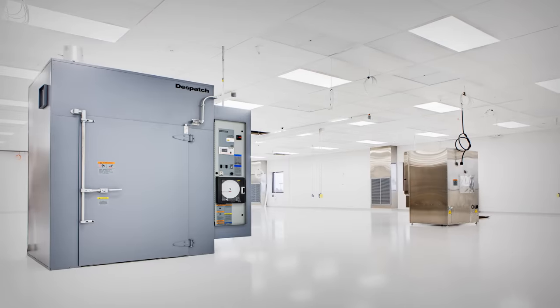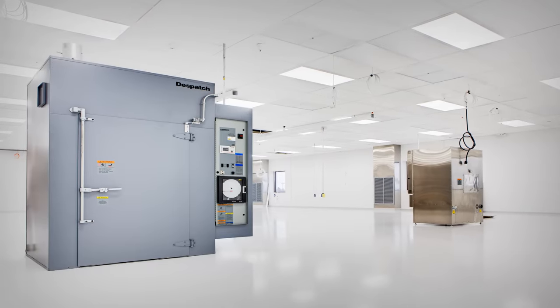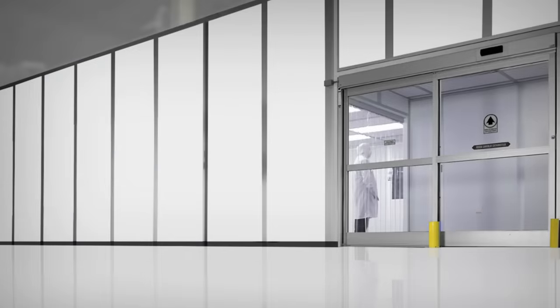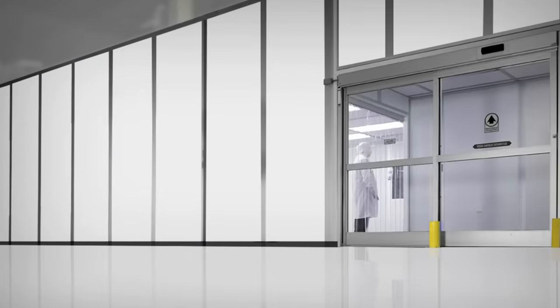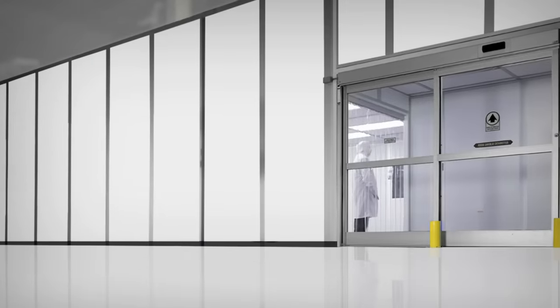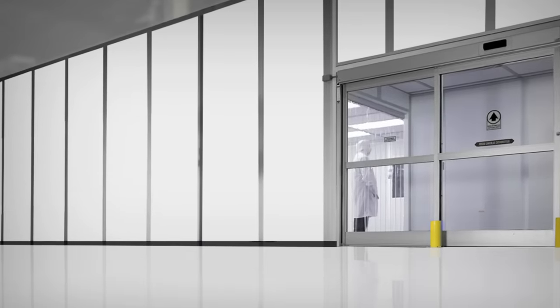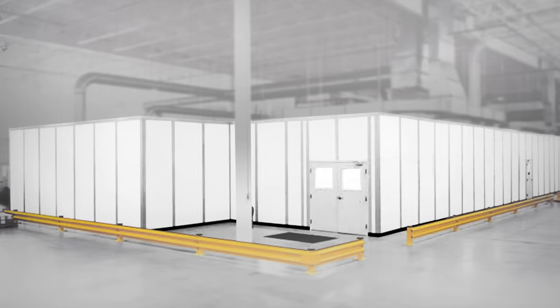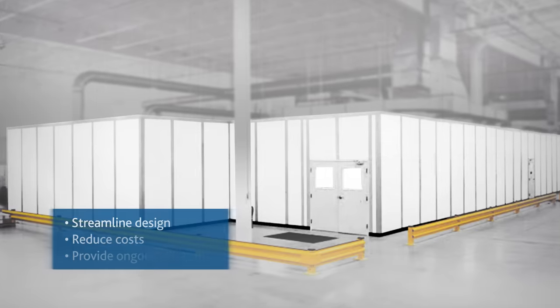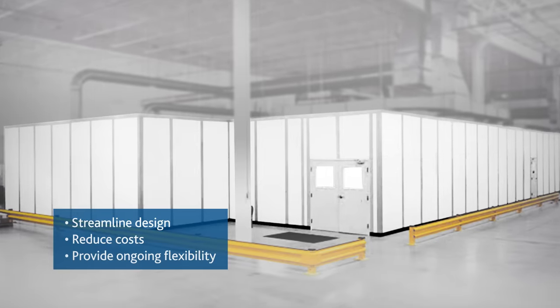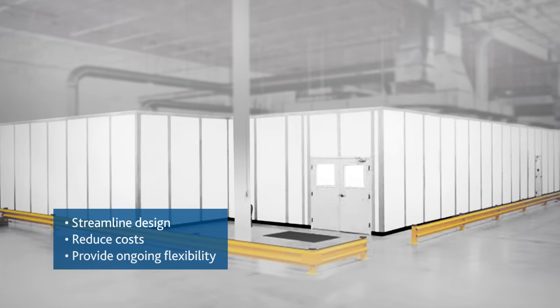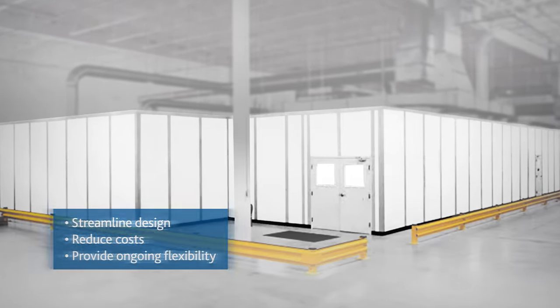With over 30 years serving the cleanroom industry, Portafab's CleanLine system simplifies cleanroom construction by using pre-engineered modular components to streamline design, reduce costs, and provide ongoing flexibility.